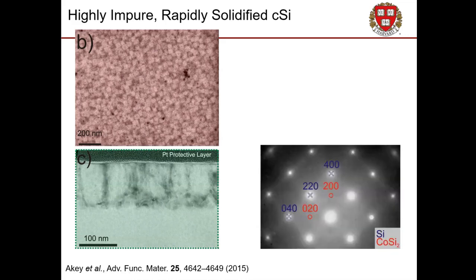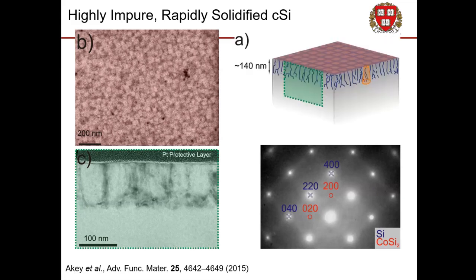However, upon doing diffraction work on that layer, no additional diffraction spots other than those from crystalline silicon are detected, meaning that these are not precipitates in the traditional sense. They are not their own separate crystalline phase. It's sort of a cartoon vision of all of this, but what exactly they are, what they're composed of, what their shape is, what their boundaries are, was not known.